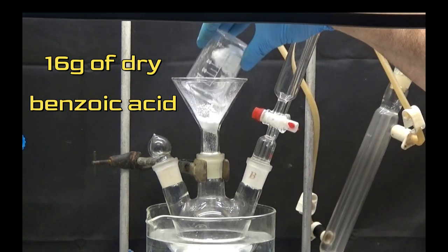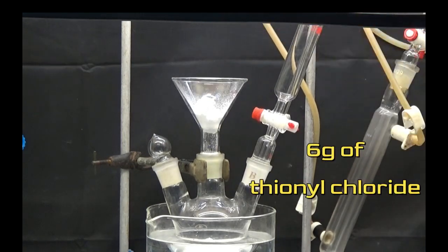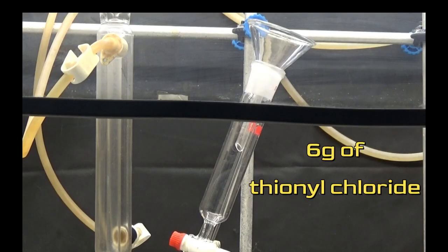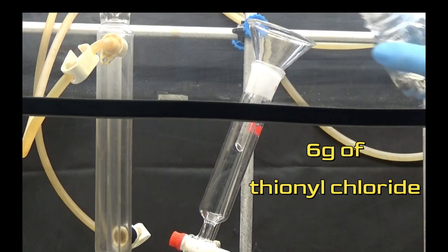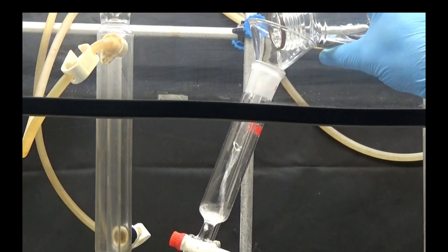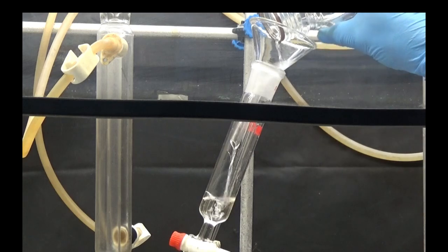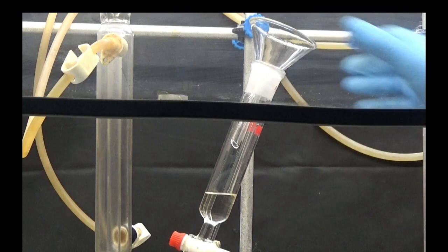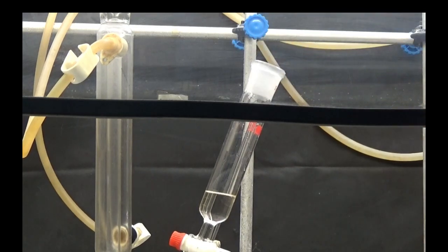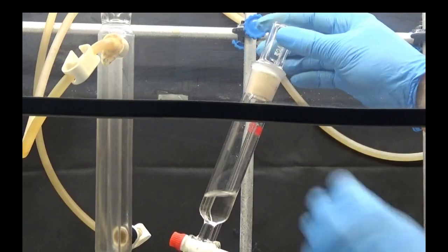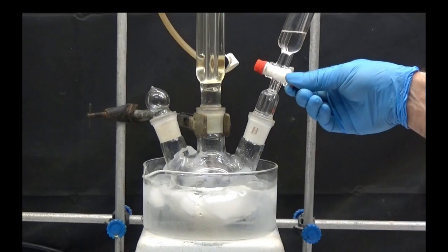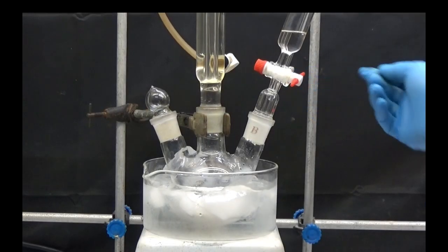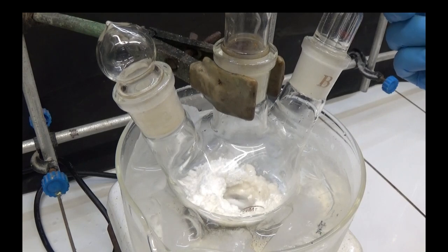Put 16 grams of dry benzoic acid in the flask and 6 grams of thionyl chloride in the addition funnel. Add the thionyl chloride slowly over the acid with stirring while cooling with the ice bath.